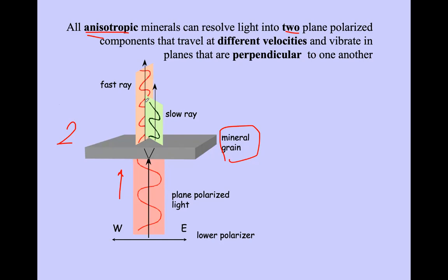If you had many minerals here, you would see another kind of bunch of reoriented lights. Say four minerals were there, there will be 2 into 4 light beam orientations. But here we have only one mineral, therefore you are supposed to have only two splitting directions.